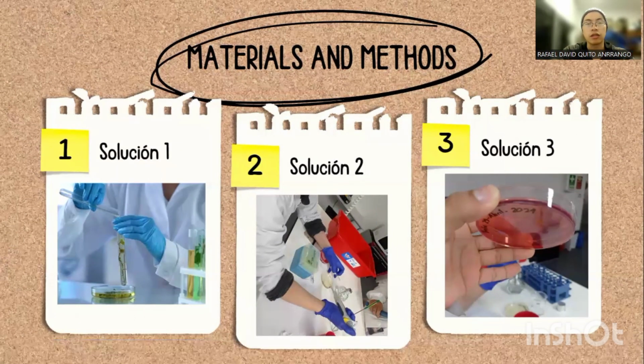2. Swabbing. Lightly moisten the tip of the swab in the sterile saline solution or peptone water. Swab an area of approximately 10 centimeters by 10 centimeters, with the swab inclined at an angle of 30 degrees. Rub the surface delimited by the template 4 times, each one in the opposite direction of the previous one. Ensure the swab covers the entire surface.